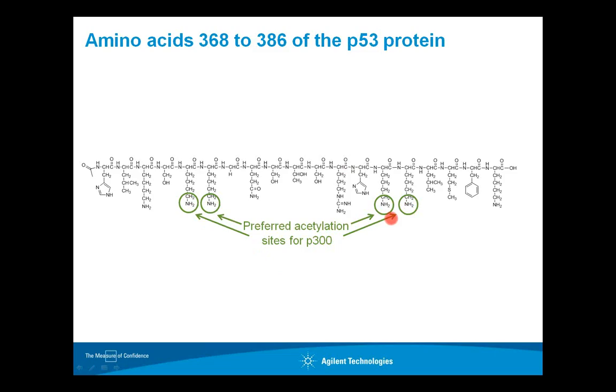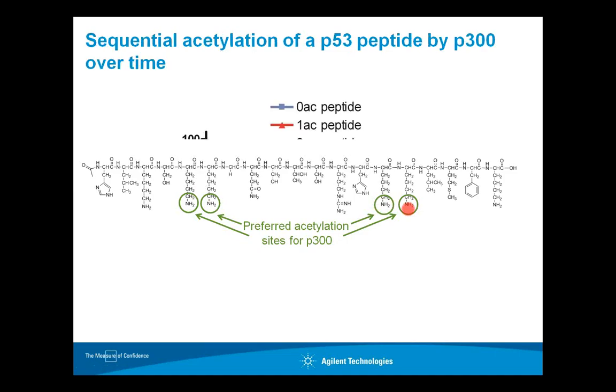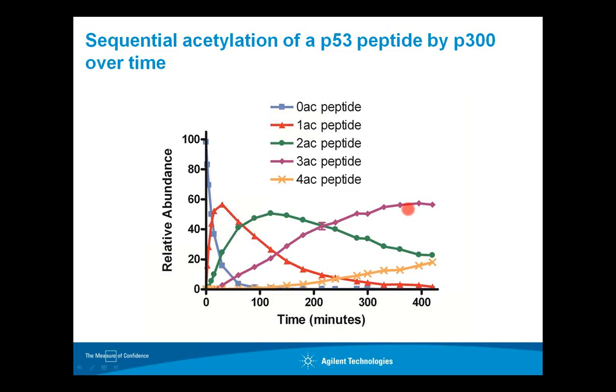a reaction that's taking place where an acetylation occurs. Even if we're using an antibody to an acetylated site, it would be very difficult for us to detect acetylation at a single site, for example, versus acetylation at 2, all 3, or maybe 4 of these sites, and of course any combination therein. However, with RapidFire, this proved very easy to do. So here's some data demonstrating this.